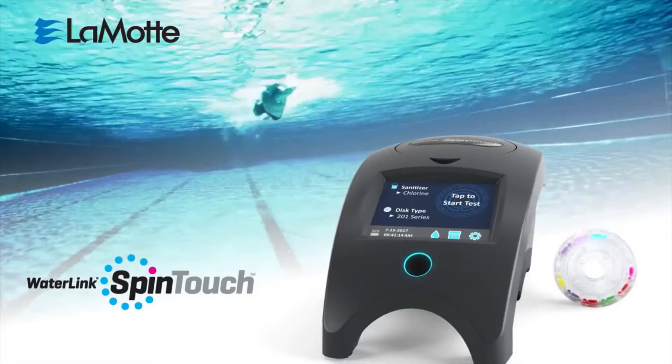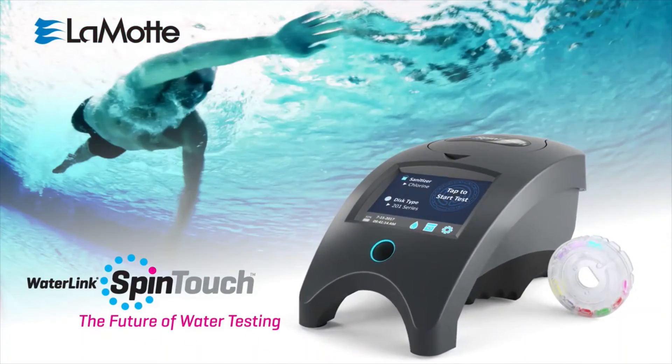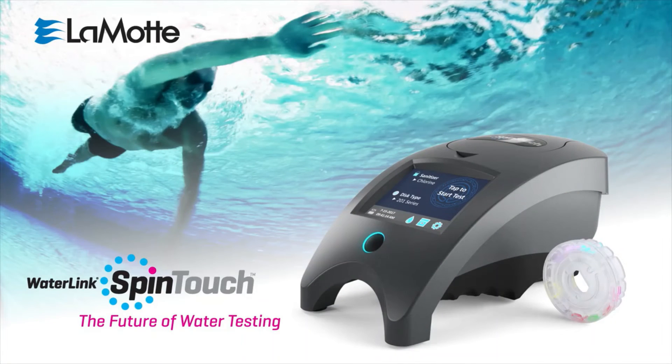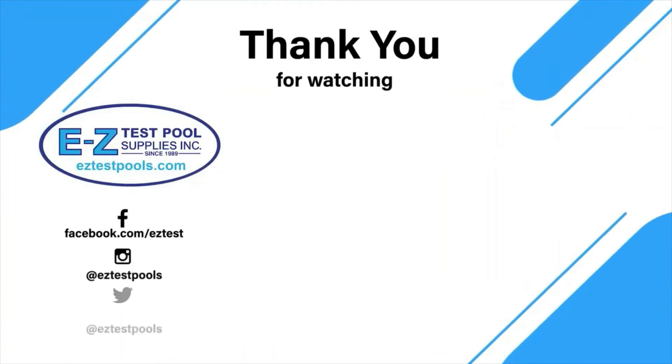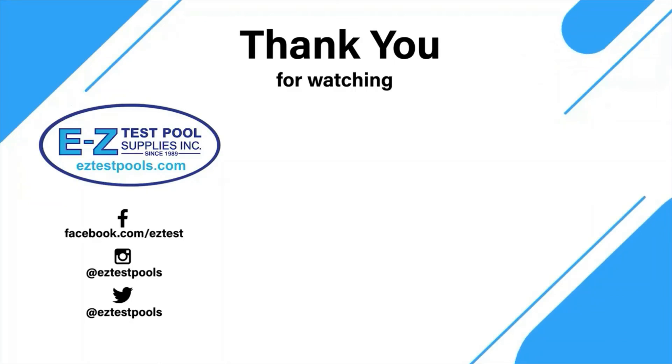The game-changing WaterLink Spin Touch with centrifugal fluidics reagent discs. You'll never test any other way.